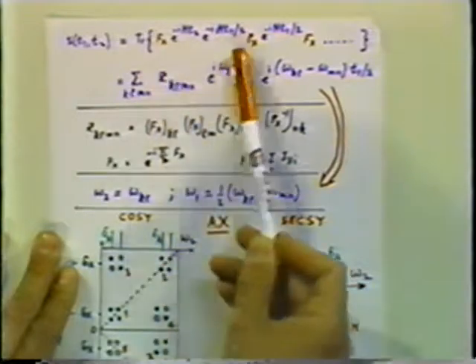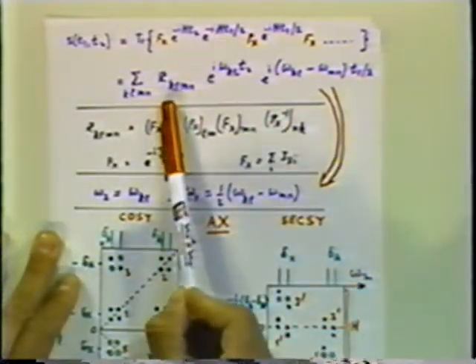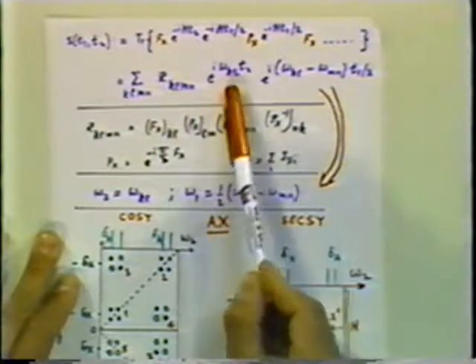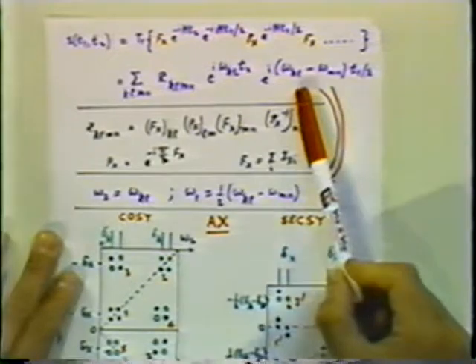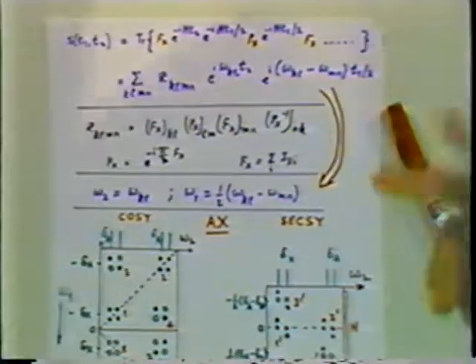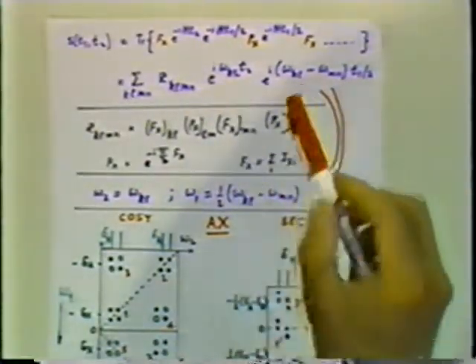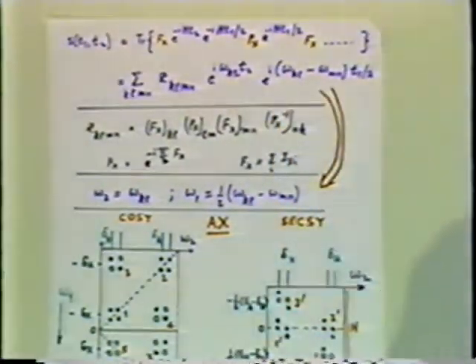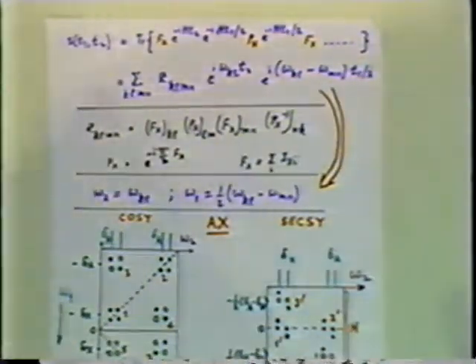If we follow exactly the same way as before, we then have the intensity which is given by ZKLMN, a frequency in the T2 dimension which is omega KL, and a frequency in the omega 1 direction which is the difference between the 2 transitions which are coupled to each other. So it gives omega KL minus omega MN by 2. That means we're taking a difference, and if it is a diagonal peak, then it becomes 0.